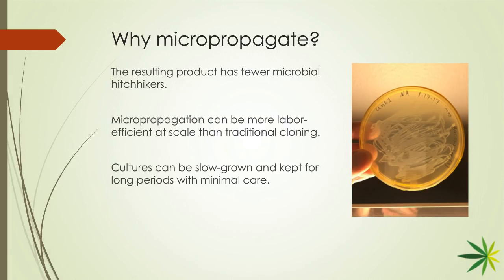Put that into a culture and you see something that grows, you know it didn't come from the surface because you eradicated everything that was living there. I was able to re-isolate this organism multiple times. We had it sequenced, and it's a bacillus that's very, very close to the bacillus people add as beneficials to their soils. This is a real thing.